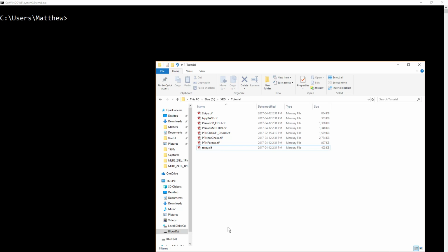Canada. This is a fast tutorial about how to combine multiple CIF files into one CIF file quickly using the DOS/Windows command line. I will also have versions for Linux and a combined one that shows Linux, Windows, and why not to use PowerShell for this.